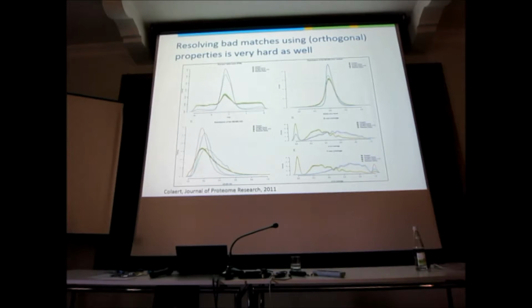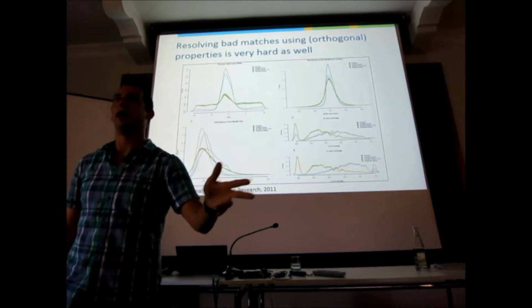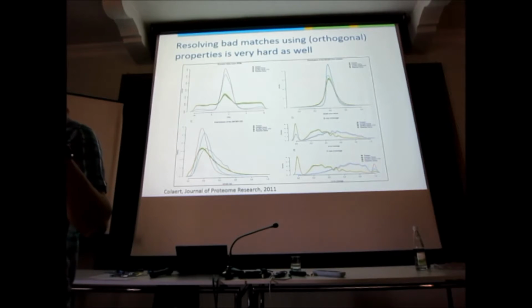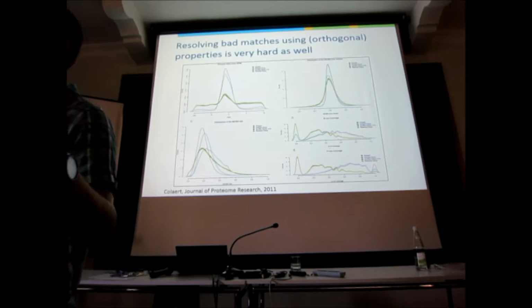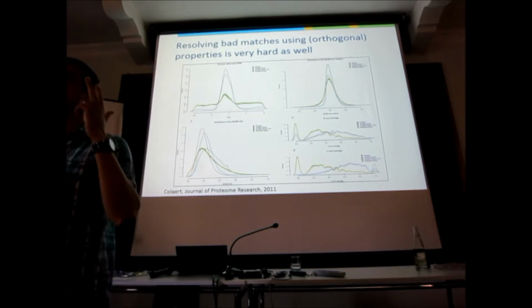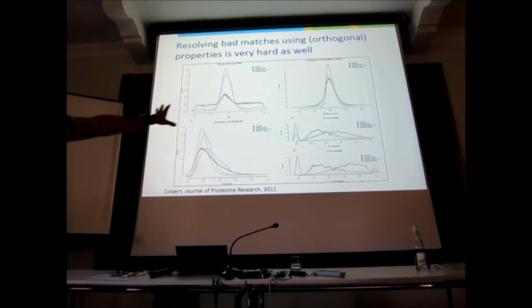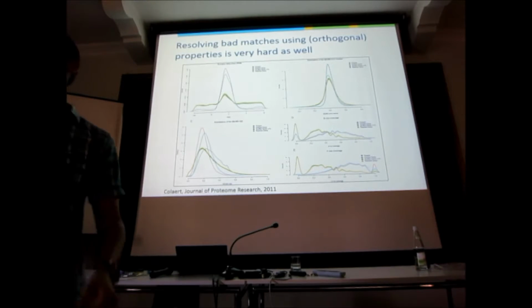Okay? So there's a lot of work to be done here to fix this problem, because you don't notice it when you search human. You don't find it when you search yeast. You don't find it when you search E. coli. But you find it when you search yeast with 15 variable modifications. You find it when you do a proteogenomics study. You find this when you do a meta-proteomics study. Not to this extent, not that bad, but you see the tail of this thing, which you have seen in the previous slides. And that is a problem that we currently cannot fix very well.